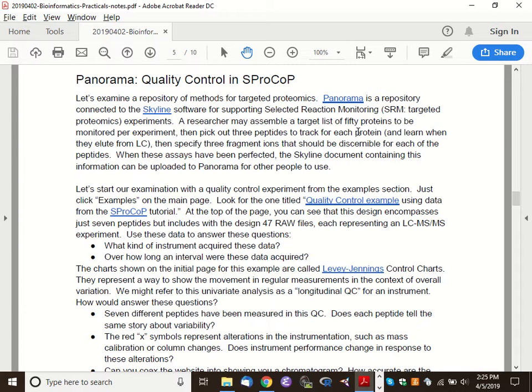So instead of having this nice smooth baseline and a single rise and fall for this chromatogram, you'll frequently see that chromatograms may individually rise and fall. But hopefully, if you've picked really well, all of the transition chromatograms are going to rise and fall together to add to your confidence that this is where your peptide of interest appears.